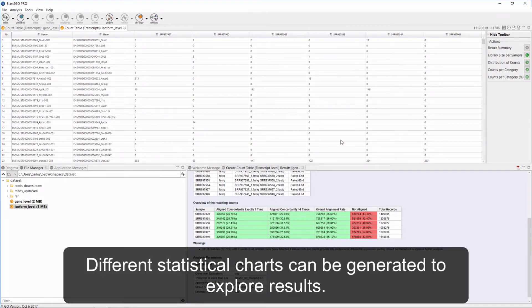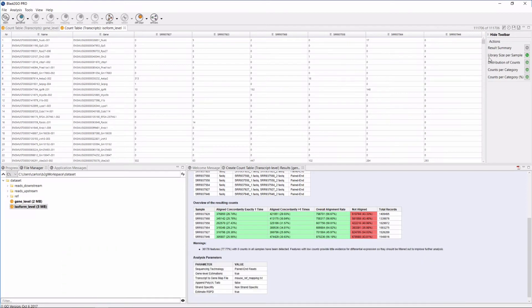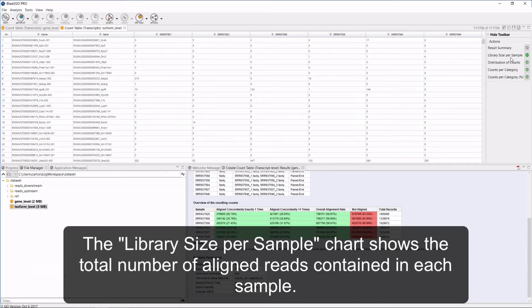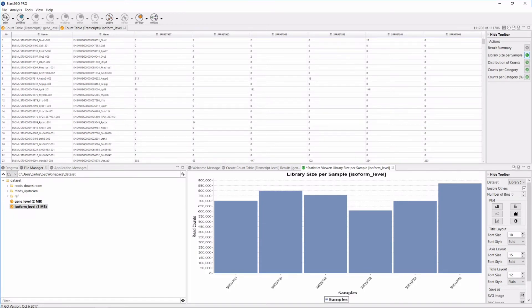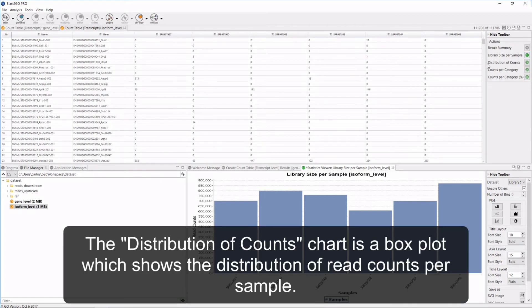Different statistical charts can be generated to explore results. The library size per sample chart shows the total number of aligned reads contained in each sample. The distribution of counts chart is a box plot which shows the distribution of read counts per sample.